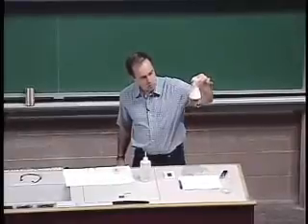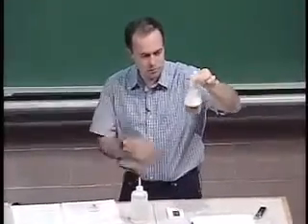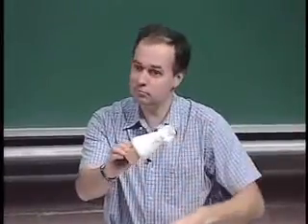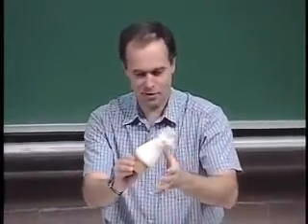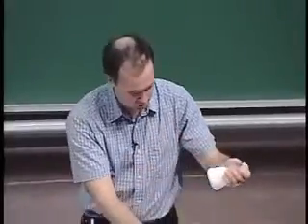This thing should be getting pretty cold by now. Not quite, yeah, it is there. So that block is so cold that it froze the water that I sprayed onto the block, and that's actually frozen right onto the thing. Not gonna let go. That's when it'll break off. Actually, oh, there. Yeah, so there's a little chunk of ice.